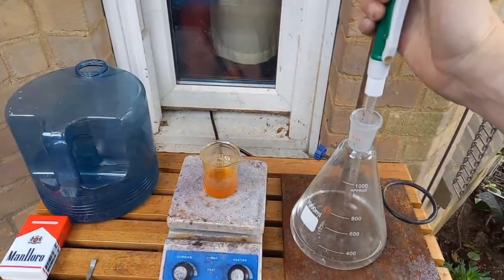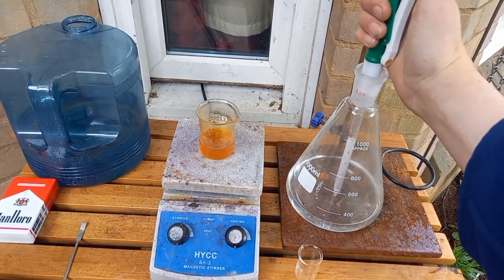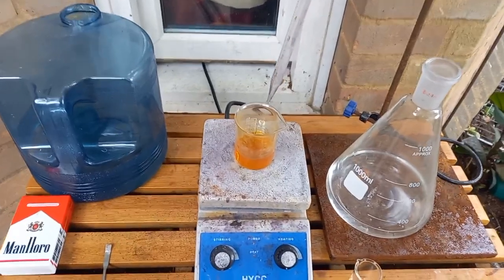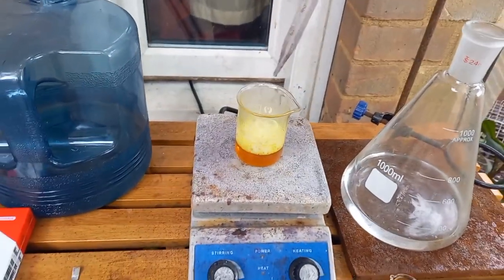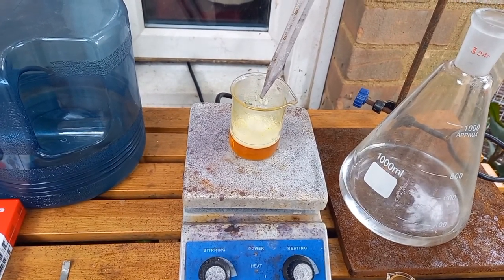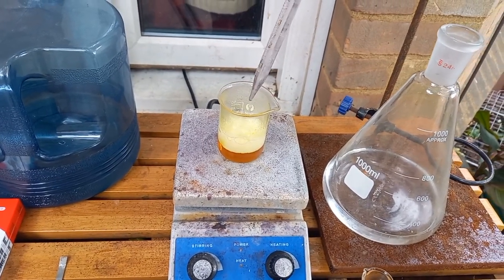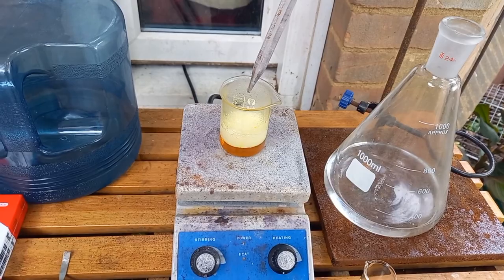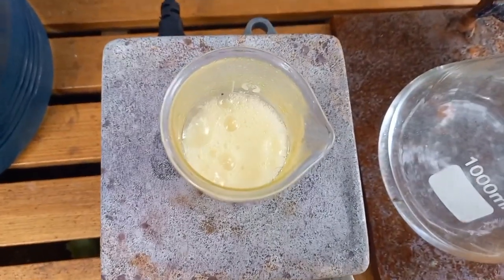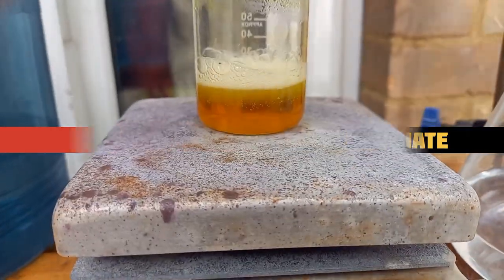Take some hydrogen peroxide — this is more than 12%. Let's see if this turns... Oh my god, yes! We're getting ferrocyanide here. Gone from red to yellow — we're getting ferrocyanide.